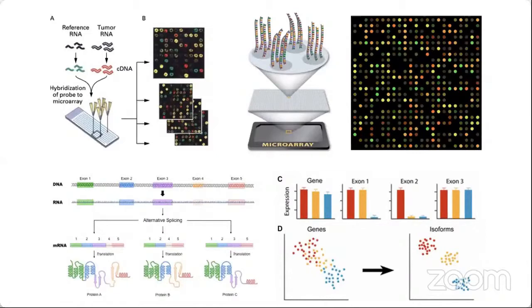In the end, what we would like to have is something like this, where the genes and the isoforms of the genes represent the difference in the type of samples or the phenotype of the samples they are taken from. Depending upon your analysis methods and your type of question, you can either go for the traditional gene expression landscape, or you can go for the isoform expression landscape, where you will get information about the alternative splice forms of the genes you are analyzing.